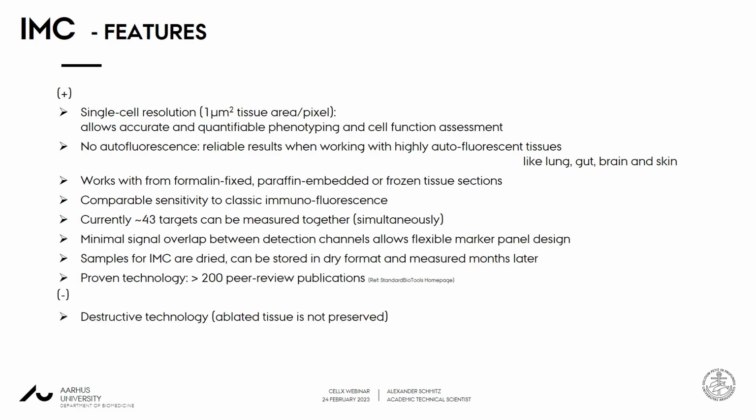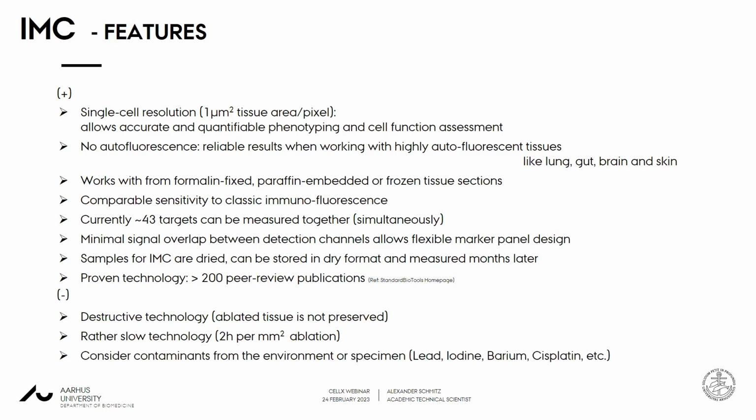On the downside, this is a destructive technology. That means the tissue that you have ablated from the slide is not preserved, it's gone, it's burnt. And it's rather slow. You can roughly calculate that 1 square millimeter of ablation takes about 2 hours. So if you have large areas or a lot of samples, it takes time. And finally, regarding the detection range, a lot of metals are also present in the environment.